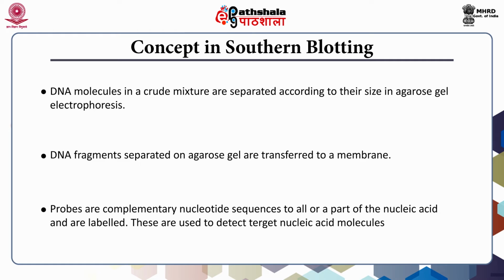The specificity of the experiment depends on the washing of the probes after binding to the complementary site. If at this step the extra probes are not removed from the system, it will give a false signal leading to a wrong interpretation.